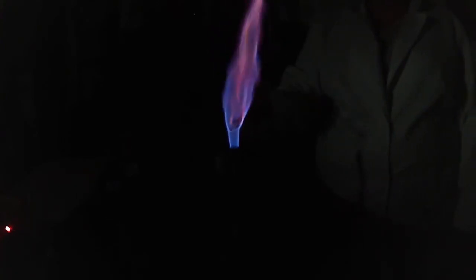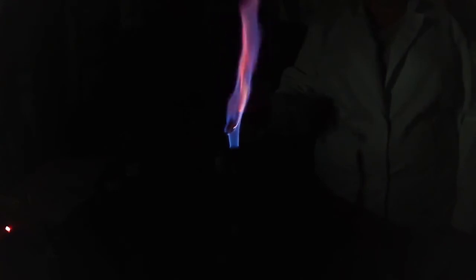The next one we're going to have is calcium. So I'm going to do a few for calcium here to get that flame going. Calcium gives us a nice kind of orange flame. In a minute you'll see. There it is, orange. So as it starts burning, there it goes. So it gives us a nice orange flame. Not that nice bright yellow, but this nice orange kind of color. Okay. Look at that. All right.